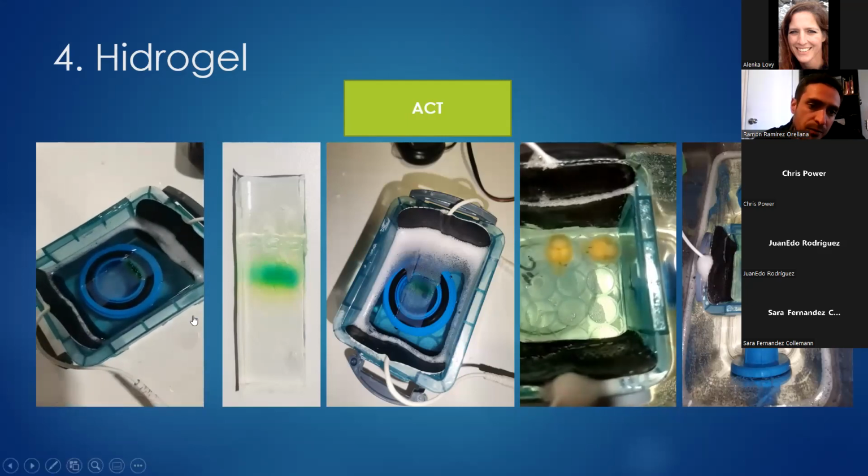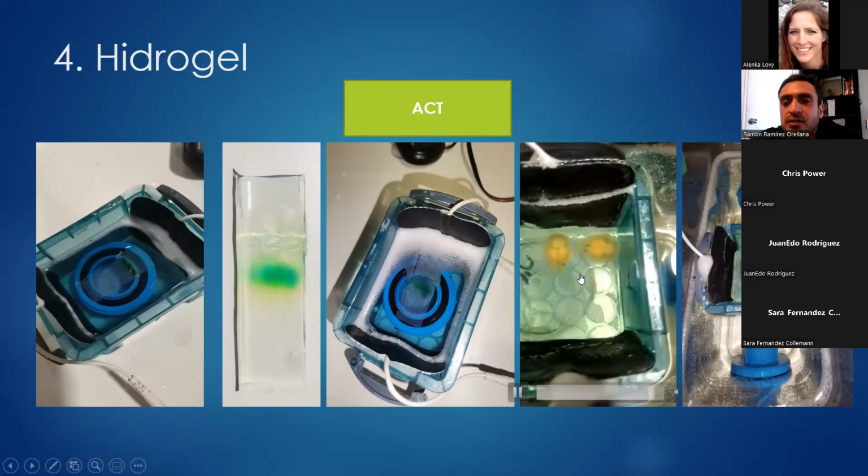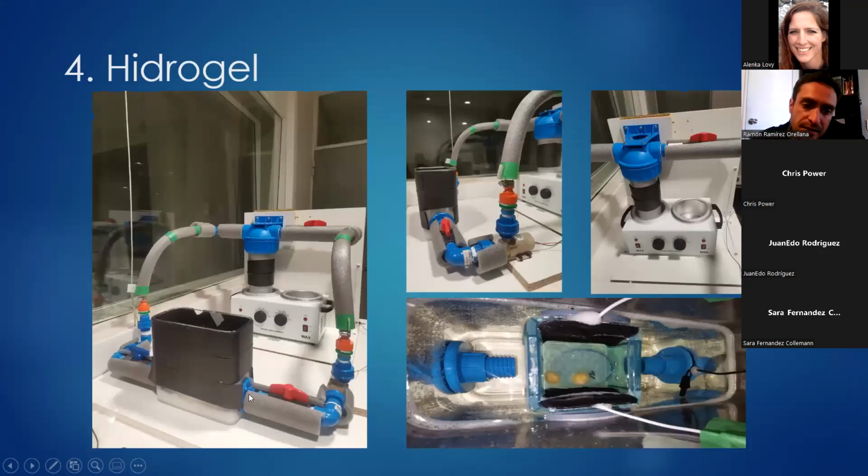Principalmente para probar esta muestra corrimos un gel y dejamos durante 14 horas los cerebros en este sistema de electroforesis, que va en otro sistema, que es este sistema de recirculación, donde acá está ocurriendo la electroforesis, y va el buffer circulando a través de estas mangueras, y es filtrado, ¿no es cierto?, y vuelve nuevamente al sistema de electroforesis.